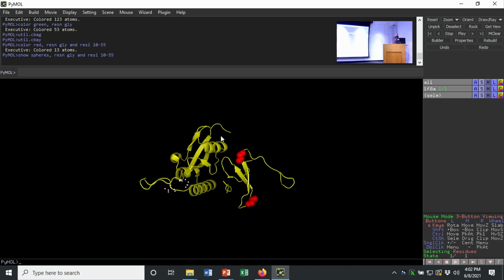And so show has a lot of different options. Let's suppose I want to do show sticks. And we'll do the same kind of thing. We'll do resi 10 to 55. And this time, give me your favorite amino acid. Tyrosine.